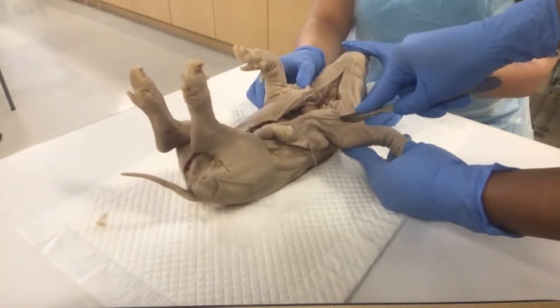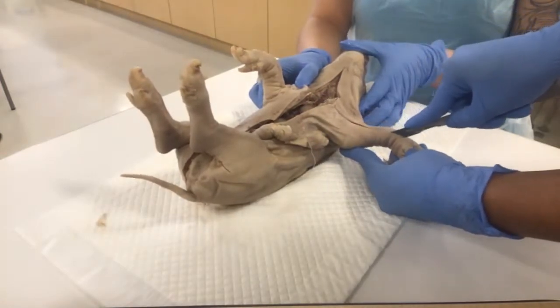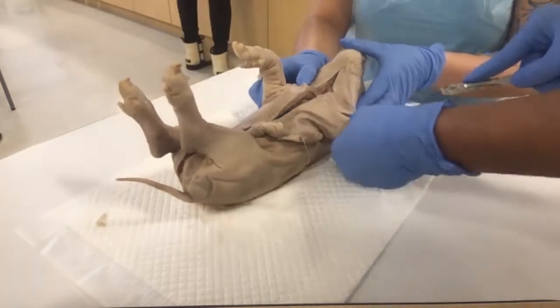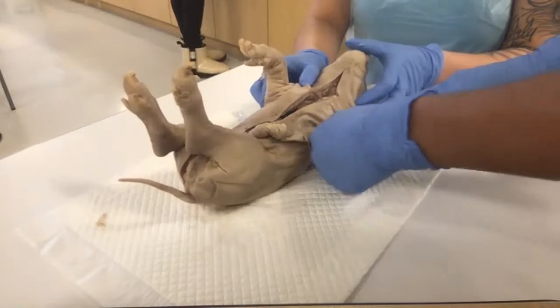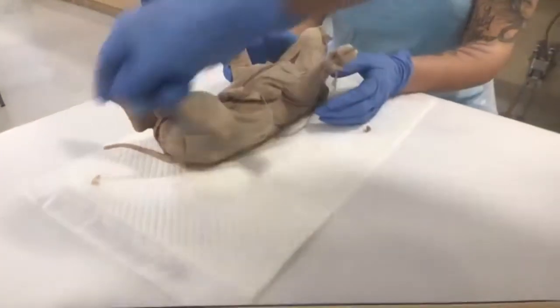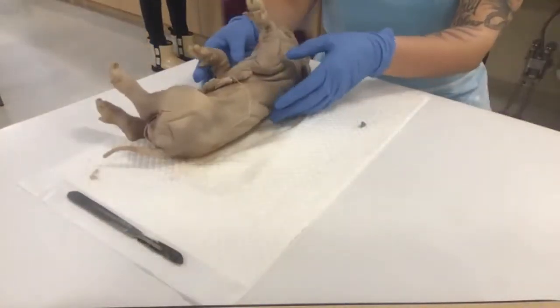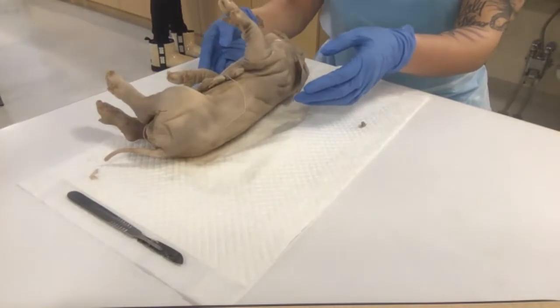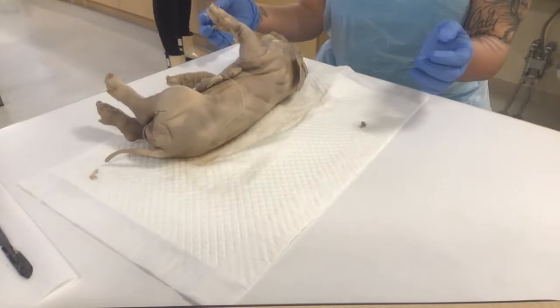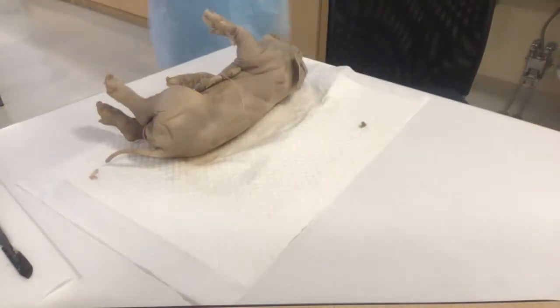Because the next thing we're going to expose, we already talked about the skin, the layer. There's layers, and then there's a mucosal layer, and then there's an inside skin, and we're going to show that in a moment, and that's our fascia. And then what we're doing now is opening up a limb, or several limbs, so that we can cut it up and see muscular tissue and its relationship to the bone via the tendons. So how the muscles come together, just like a chicken bone.